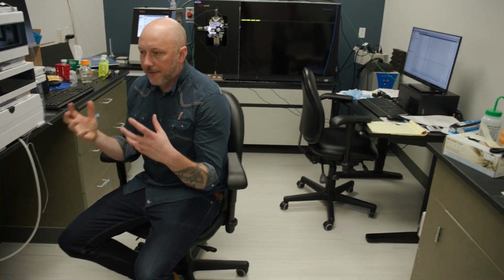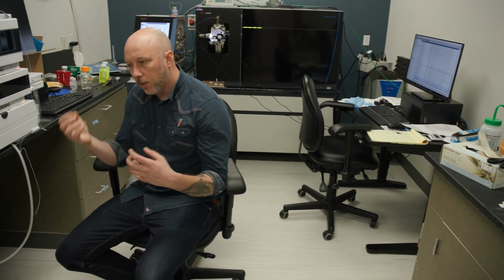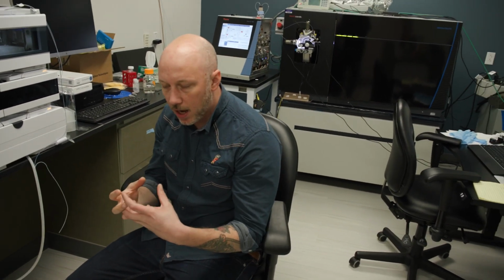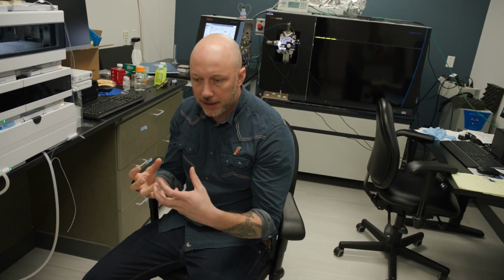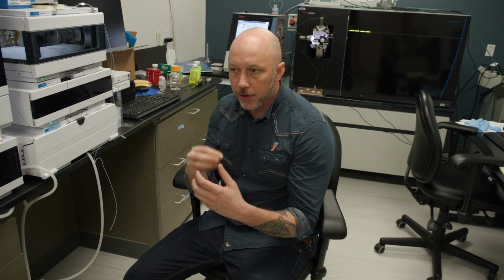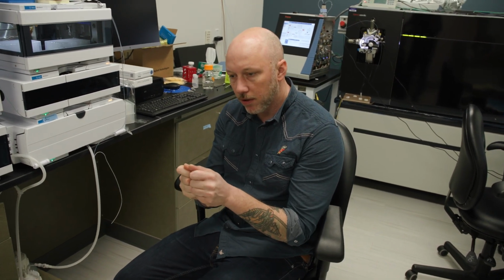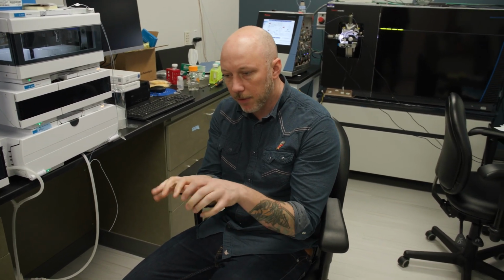So we do chromatographic separations on multiple scales, and what that means is that we have a pool of analytes, and let's say there's 1 million things in that sample, and we want to see as many of them as we can. Per unit time, we can only look at, let's say, 100,000, right? So what we want to do is we basically take those 1 million molecules, or those 1 million analytes, and we separate them based on their chemistry.